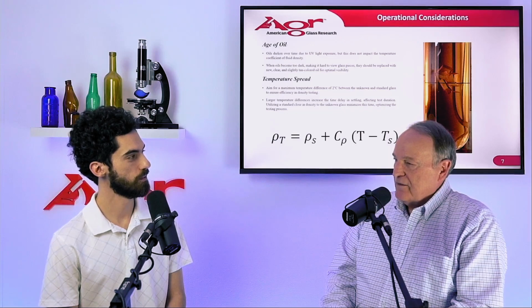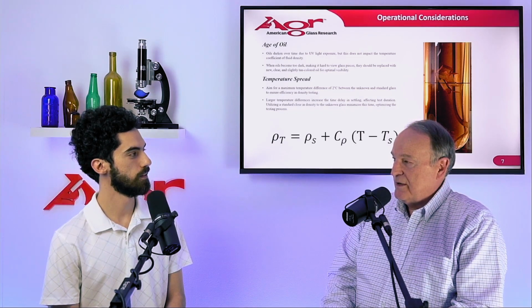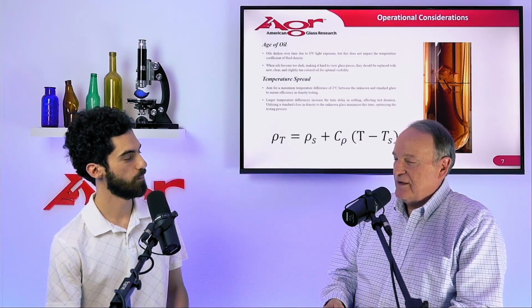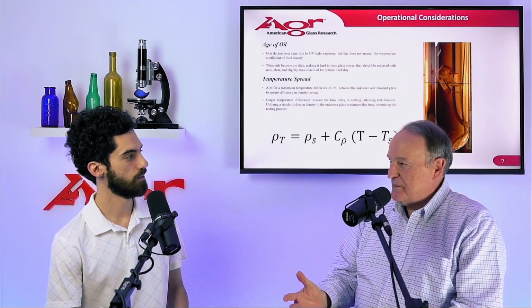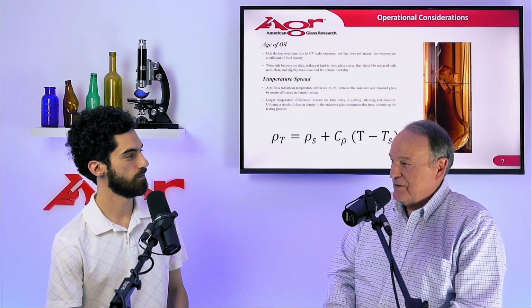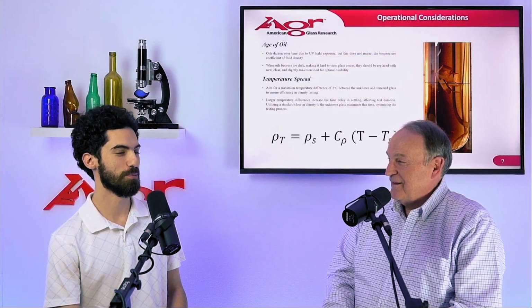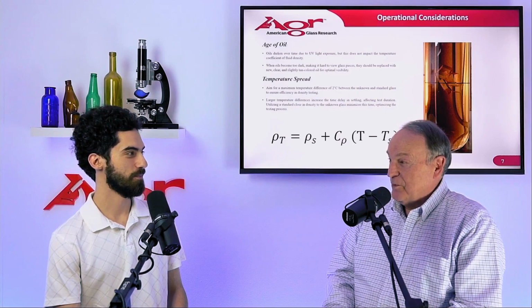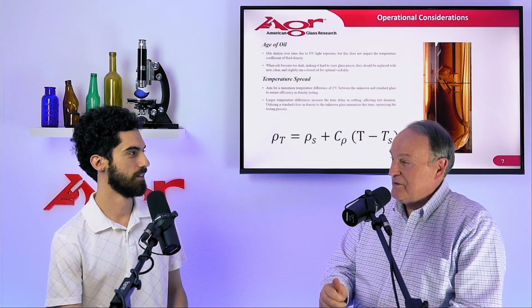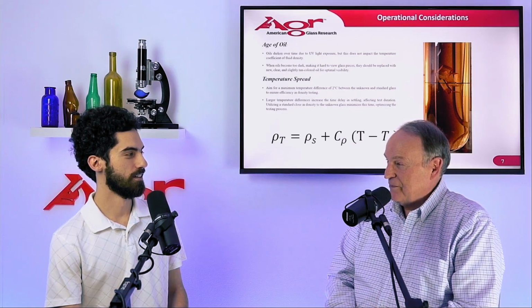You would like to have the standard and the unknown fall no more than 2 degrees centigrade apart in temperature. That's important because of what you just mentioned. At 2 degrees centigrade difference, with 1/10 of a degree centigrade per minute change, that's 20 whole minutes. Sometimes people get impatient and go from the automatic back to manual just to speed it up, and that could disrupt the equilibrium and temperature of the oil.